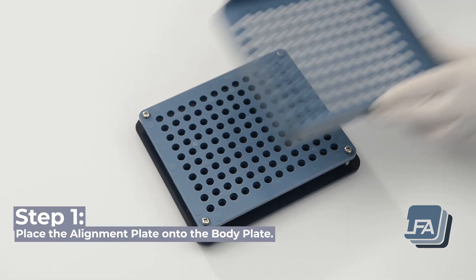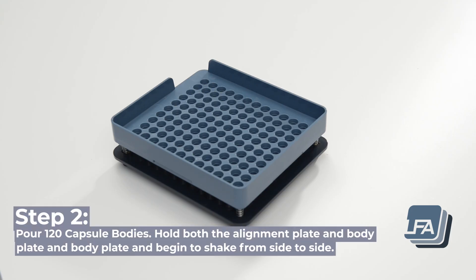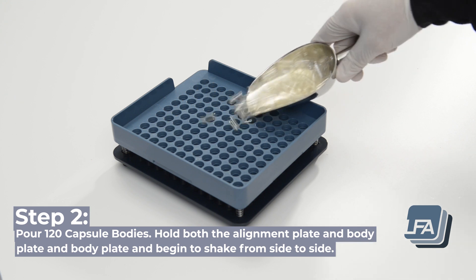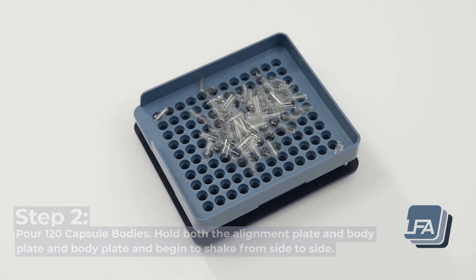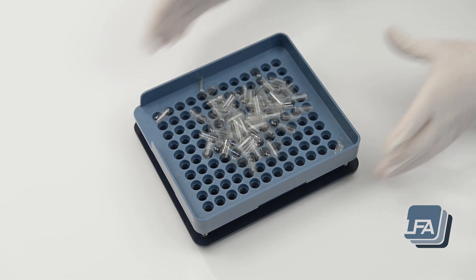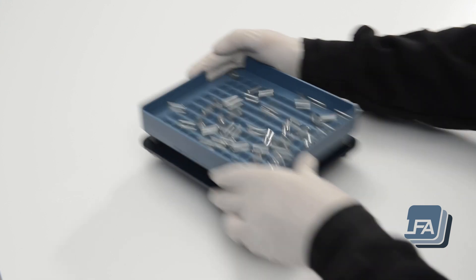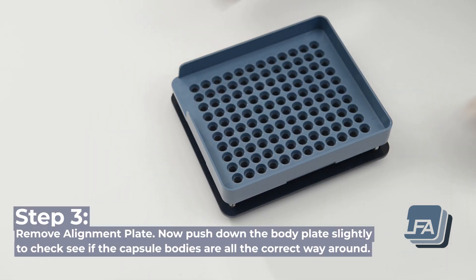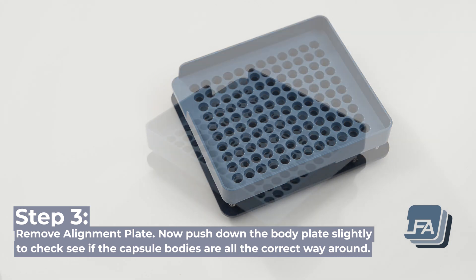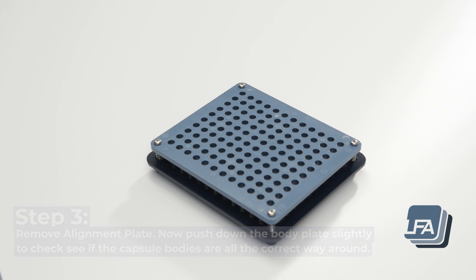Step 1: place the alignment plate onto the body plate. Step 2: for 120 empty capsule bodies, hold both the alignment plate and body plate and begin to shake gently from side to side. Step 3: remove the alignment plate, then push down on the body plate slightly to check if the capsule bodies are all the correct way around.